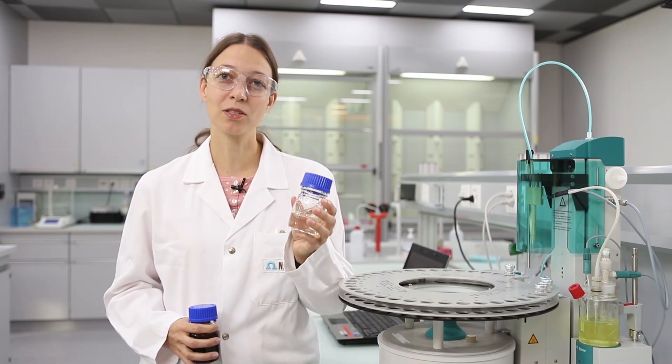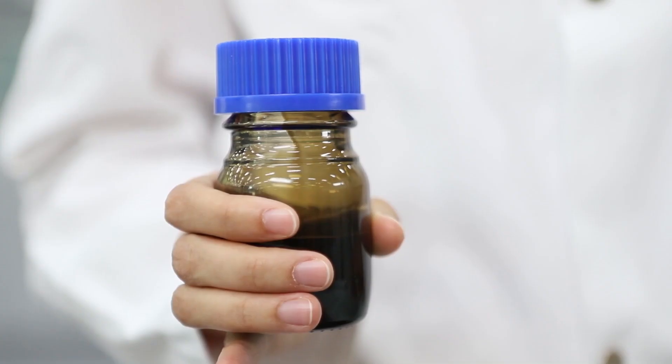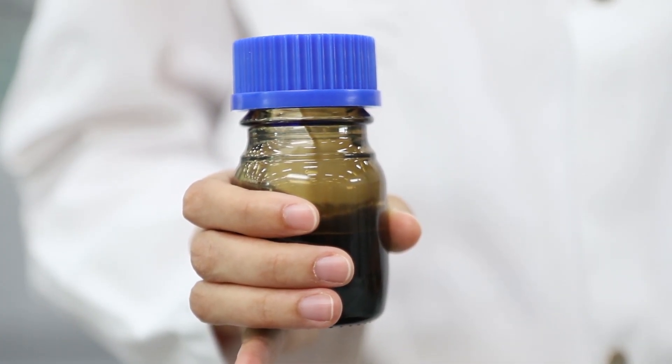Do you analyze the water content of petroleum products, lubricating oils or additives according to ASTM D6304? If your samples don't look like this, but rather like this, then direct analysis isn't an option for you.